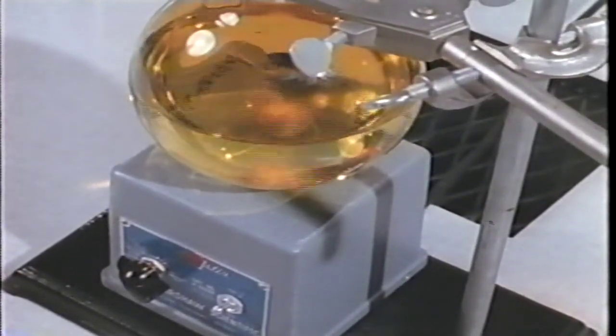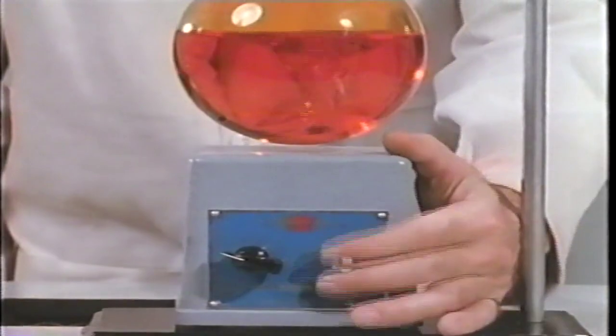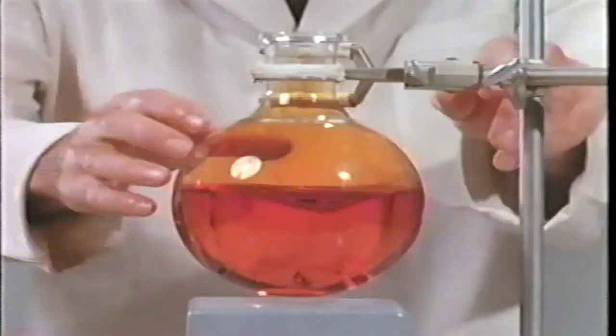Vigorous and prolonged stirring gives us a saturated solution. The brown color is characteristic of aqueous bromine solutions. However, some drops of bromine remain undissolved. This indicates that elemental bromine is not highly soluble in water.